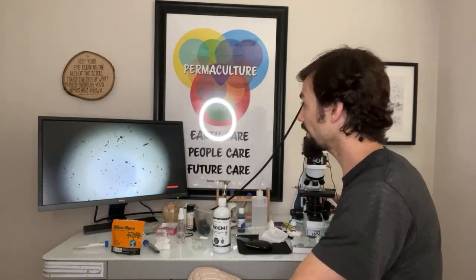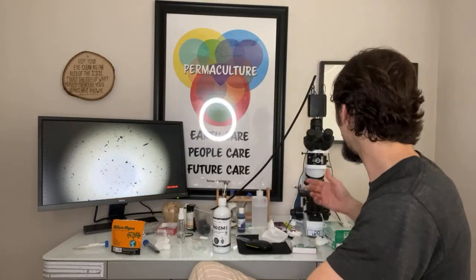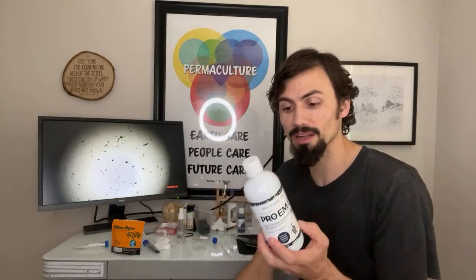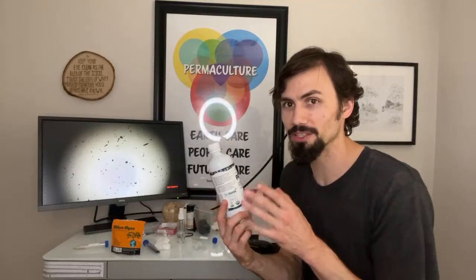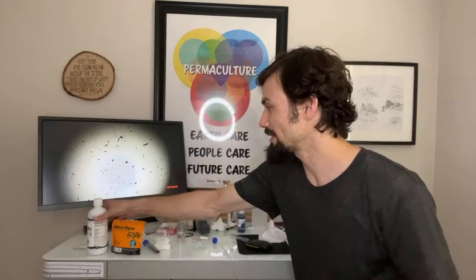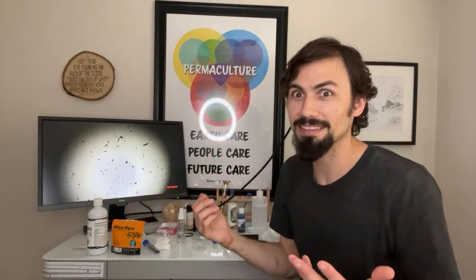But in comparing, this is incredibly fungal. Compared, like its effect on the aggregates, its effect on the foods. And this is why people are using it to digest things, and they get more fungal dominant compost when they're using EM. Because I mean, you just turn on the lights and you see things glow. That means it's fungal. And that's how easy epifluorescence is.